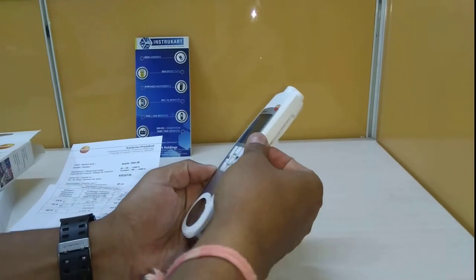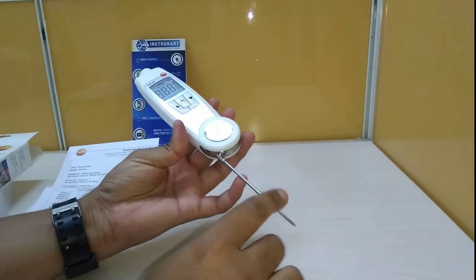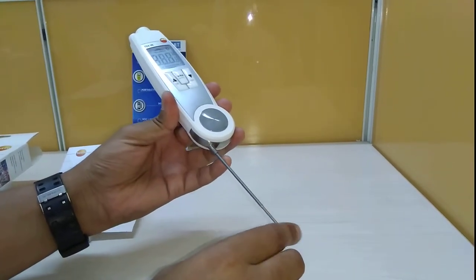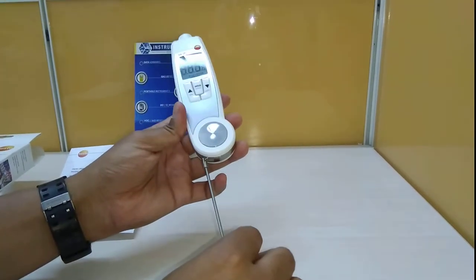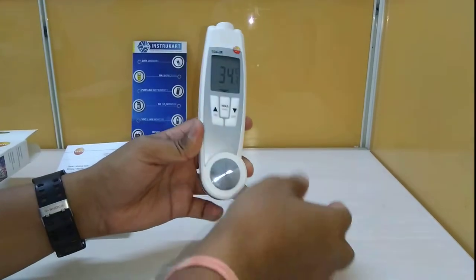Coming to the penetration probe, this is an NTC sensor type and has a measuring range of minus 50 to plus 250 degrees Celsius, with a resolution of 0.1 degrees Celsius and the same measurement rate.